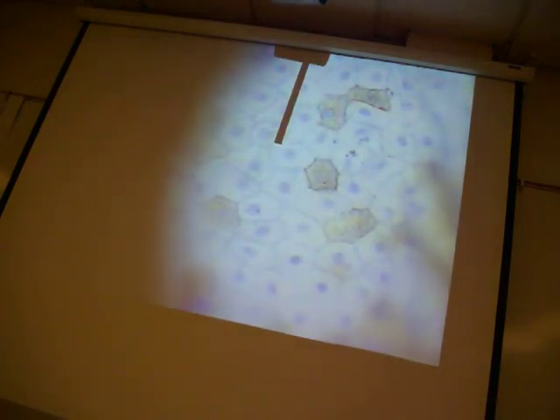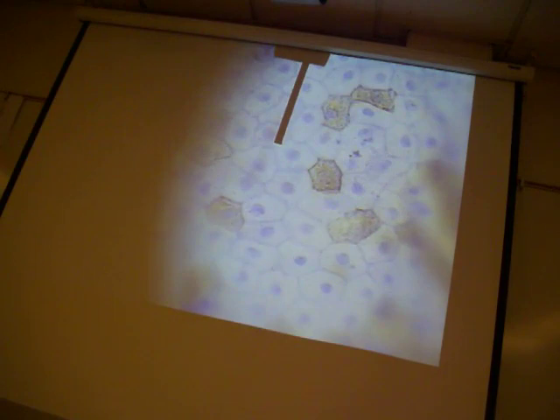You can't see that they're really thin, but what you're looking at is the dorsal aspect of it. These guys are thin, which allows for diffusion. One of the biggest things about frog or amphibian skin is they have simple squamous epithelial tissue, mainly because amphibians do about 80% of their gas exchange cutaneously.